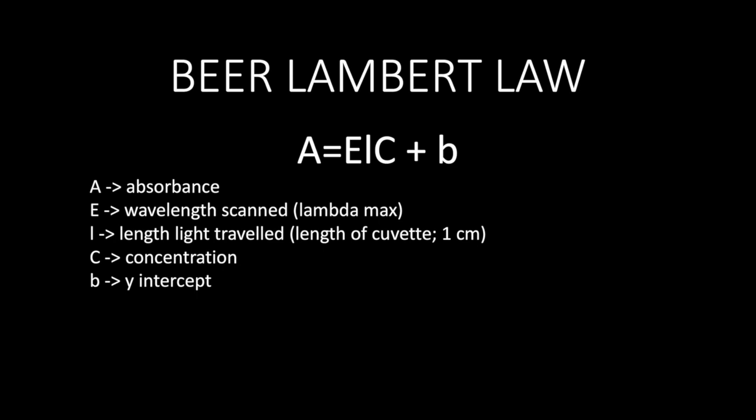When you zero the spectrophotometer before using it, you're setting B to equal 0. If you don't zero the instrument, B would be equal to some other value and it could potentially ruin calculations. Any absorbances found would be shifted off by the value of B and thus unusable.